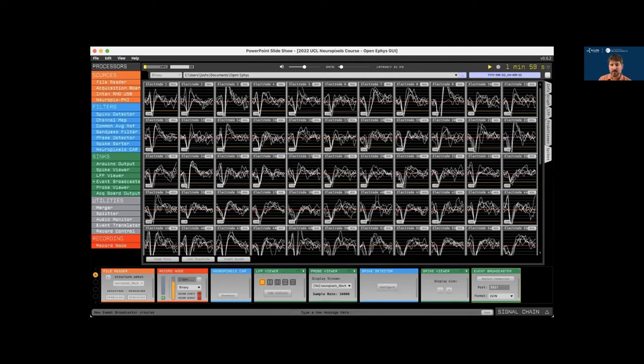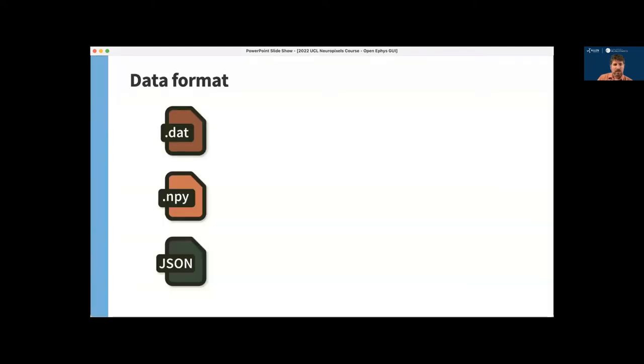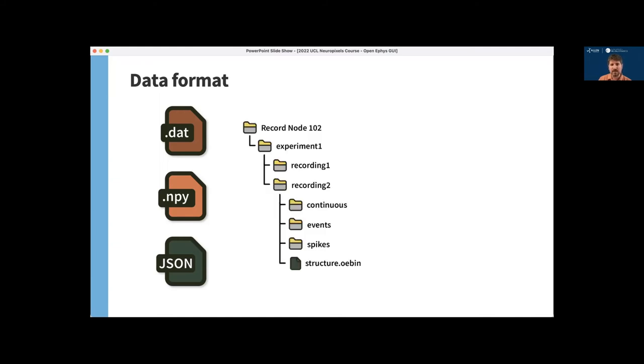So I want to talk briefly about the default data format used by the GUI known as the binary format. This stores continuous data as DAT files, which are exactly the same as Spike GLX bin files and can be loaded directly by most spike sorters. Events and timestamps on the other hand are stored in NumPy files, which are easy to read in either Python or MATLAB. And all metadata is stored in standard JSON files. And since you can record data at any point in the signal chain, there will be a separate directory for each record node. And then new experiment directories are created every time you stop and restart acquisition, which resets the hardware timestamps. And then new recording directories are created when you just start and stop recording, so that the timestamps will be consistent between those directories.